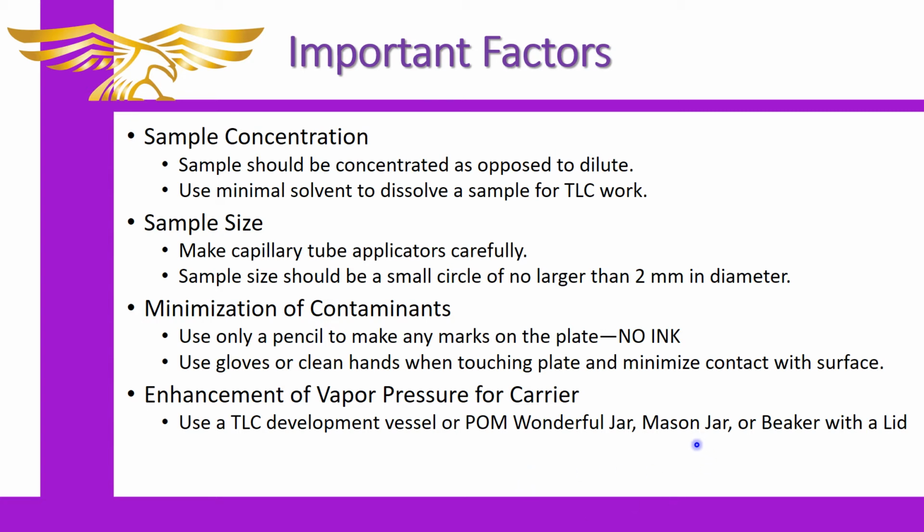Mason jars would be a good option. Beakers that can have a lid put on them. And not many beakers do have lids, but you can place a watch glass on top and you can block off the ridge from which the pouring spout on the beaker with a piece of filter paper or something like that. Probably not parafilm, because it will eat through the parafilm, but you can use some filter paper or something, and that will slow the loss of vapor and will promote rising.